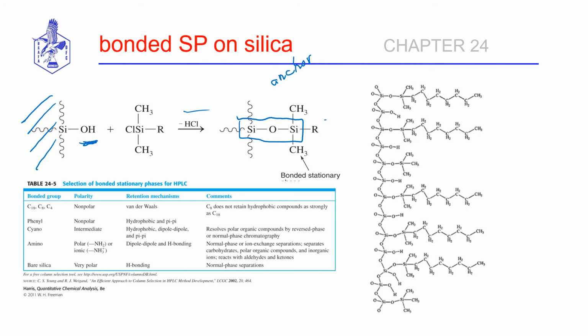Okay, here's our desired R group. Okay, and in the illustration to the right, we've got an 8-carbon long chain, so that's a C8 stationary phase, this long chain here, and the other side groups on my silane, I've got 2 methyl groups out here. So this is, once again, an illustration of what the surface is going to end up looking like after we've modified it with our C8 functionality.